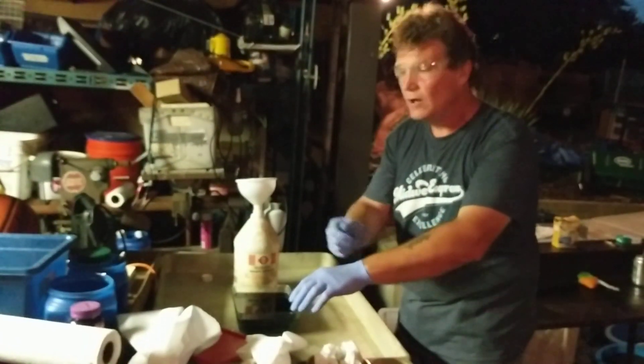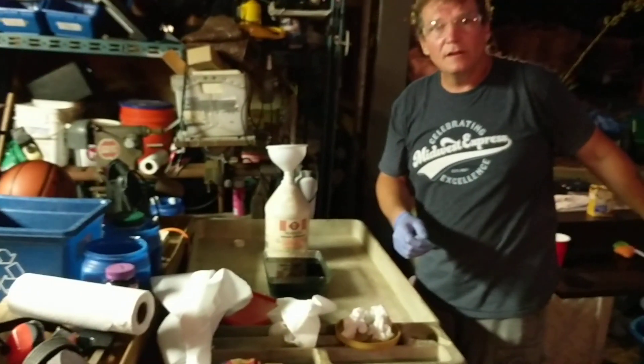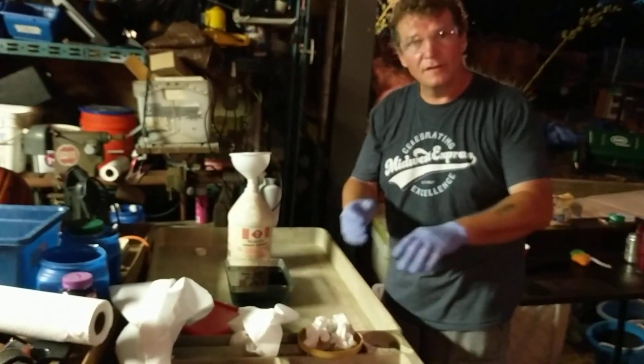I'll wipe it with a paper towel, wipe it with another, then hit it with the baking soda, and then we'll hit it with water.